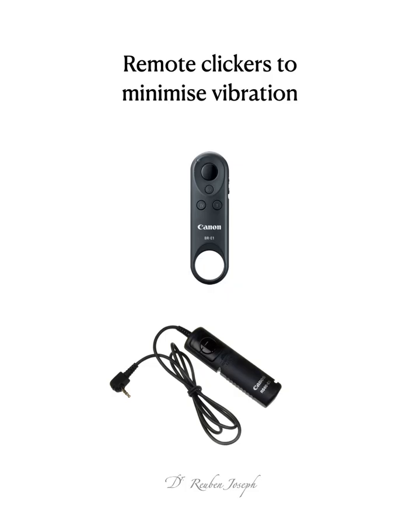So when you click pictures using a microscope, there is going to be one other problem, which is vibration. When you press the clicker on the camera, you will move the microscope, which will result in blurry images. To avoid this problem, it is advisable to have a wireless or a wired clicker separately and ask your assistant to click the picture after you are done focusing the image.